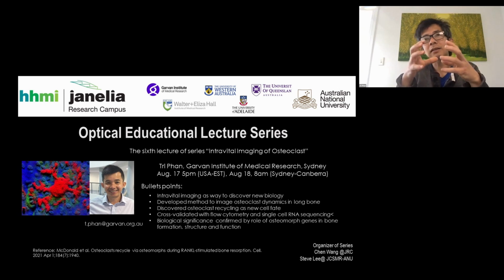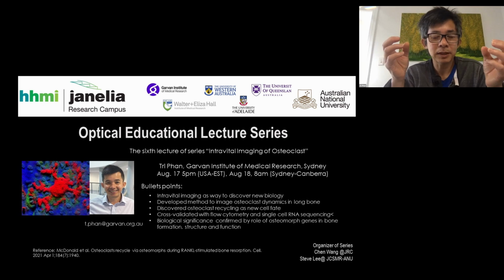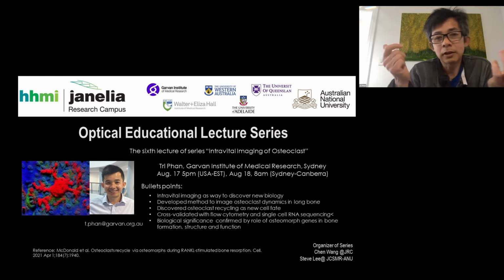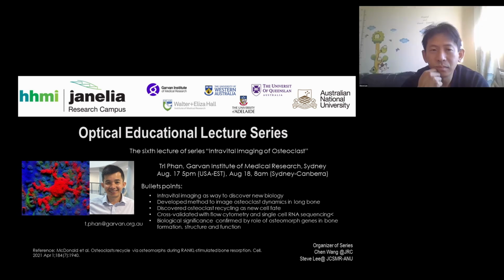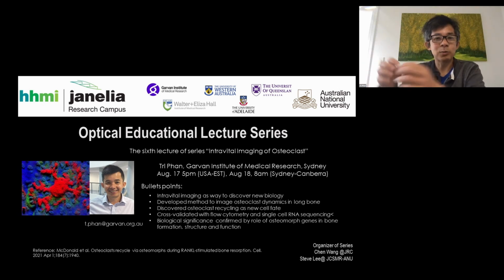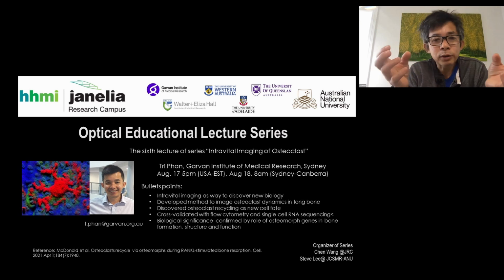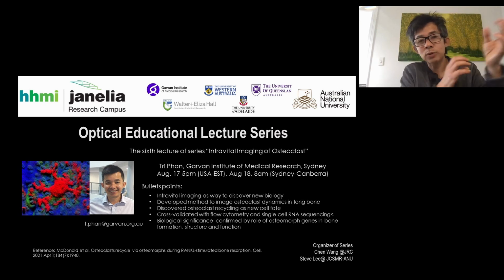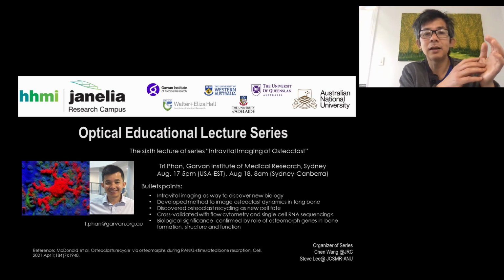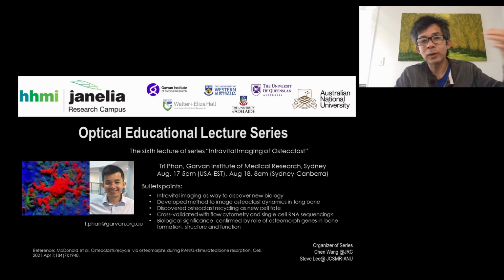But one of the things is that some of these osteoclasts have a dozen or more nuclei, and when they break up, you would imagine that as they partition, some of the daughter cells will have 2, 3, maybe even more nuclei as well. And so I think what we're capturing there is still something quite dynamic, in a state of flux. So whether they fission even further, until they become mononuclear, or whether that initial 1 or 2 fission processes is enough, for whatever reason triggered it in the first place.